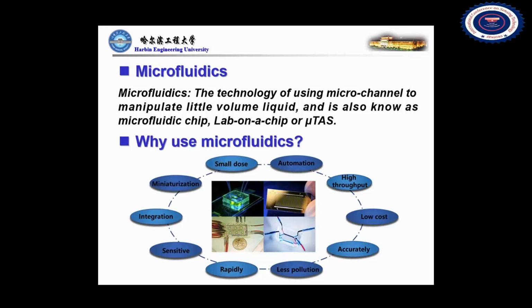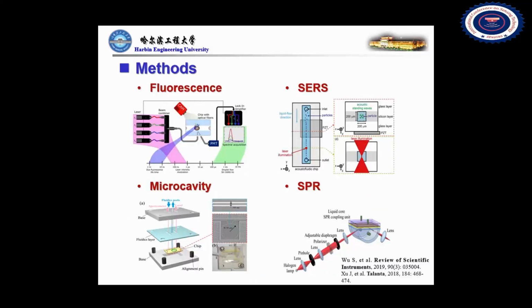The strong interaction between light and fluid can be promoted by integrating the optical system into the microfluidic chip. During this process, the characteristics of light, such as wavelength, amplitude, phase, polarization, intensity, and frequency, will change. The fluid detection can be realized by analyzing the changes of output light characteristics. It can be used for drug delivery and sorting and analysis of pathogens or metabolites.